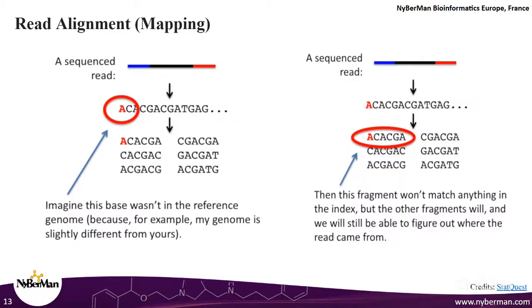Each read, whatever position it has mapped to, you have that information in a single file that is known as the SAM file. There is a lot of other information as well in the SAM file, and we will come to it when we study and understand the SAM file. But this is the key information that is there in the SAM file, that is, from what position till what position did this sequencing read match.